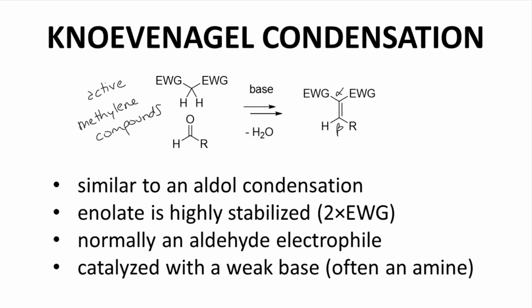Because of the strong acidity of the alpha carbon in the active methylene compound, weak bases are often used for the Knoevenagel. Amines are common. The Knoevenagel is a very old reaction and dates back to the very late 1800s.